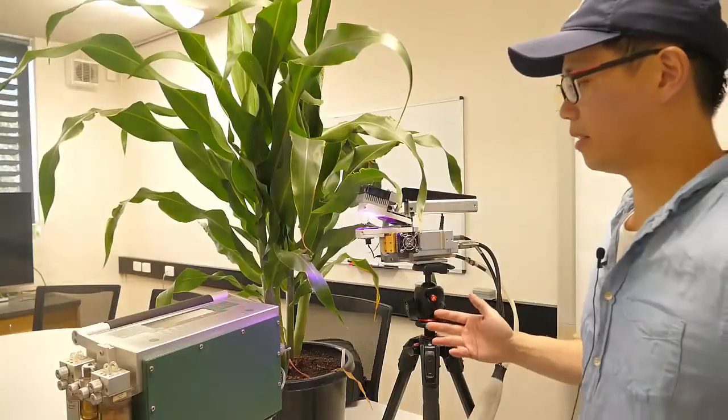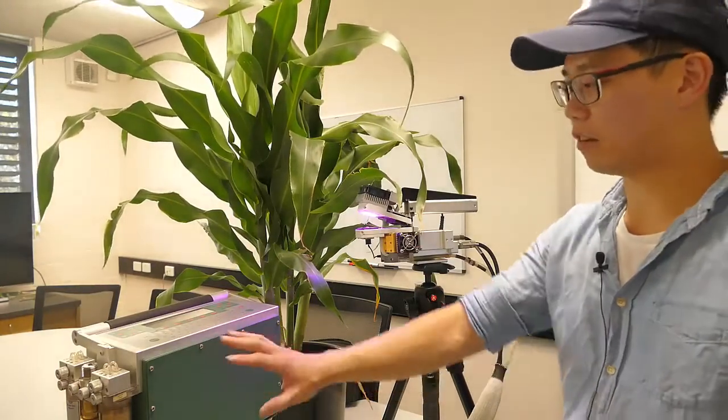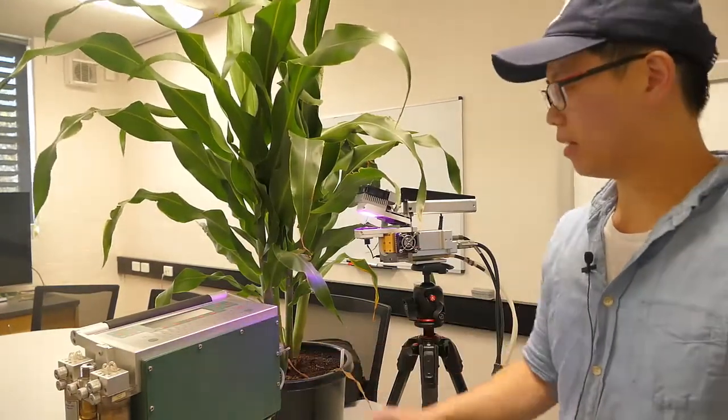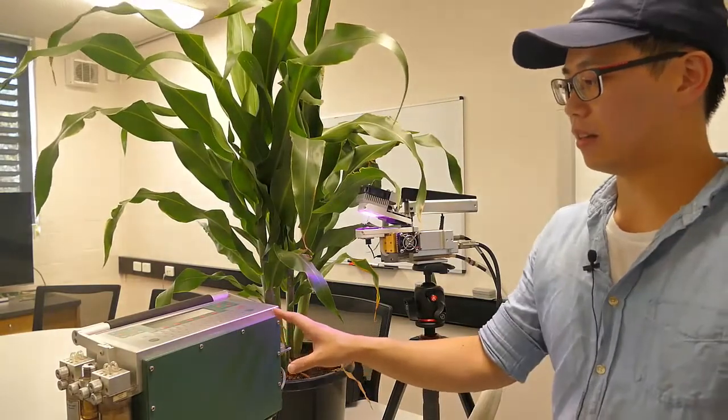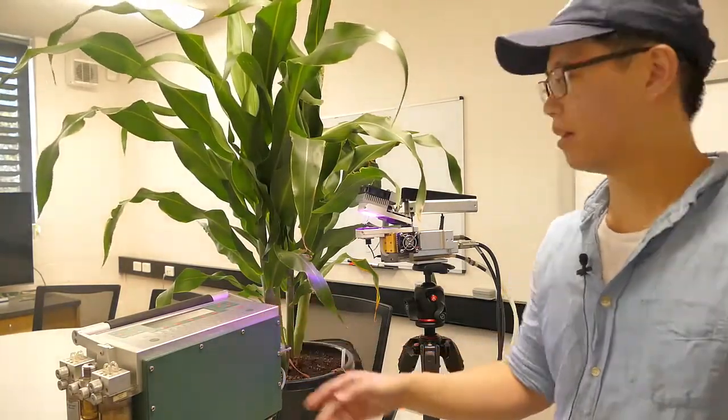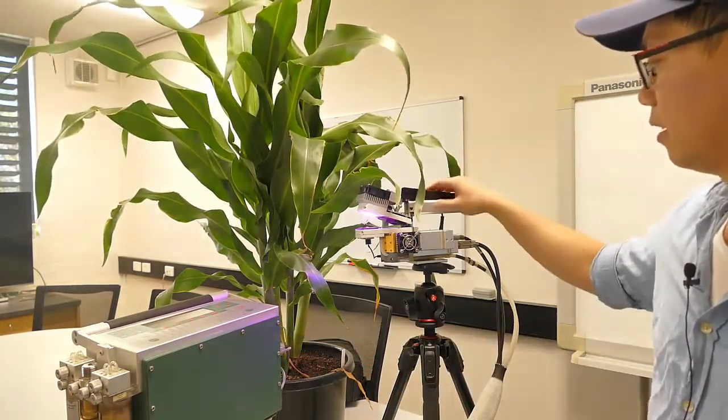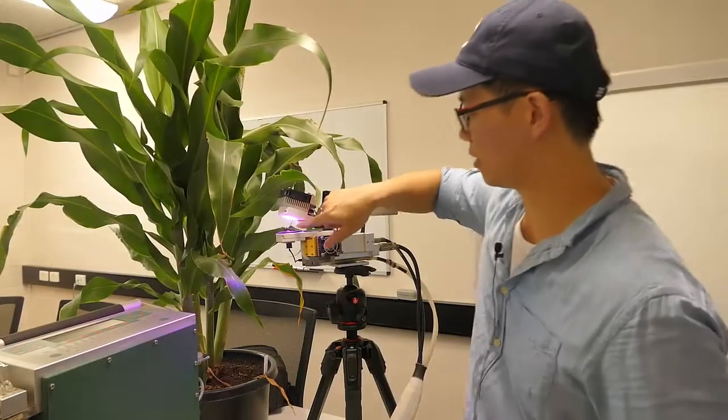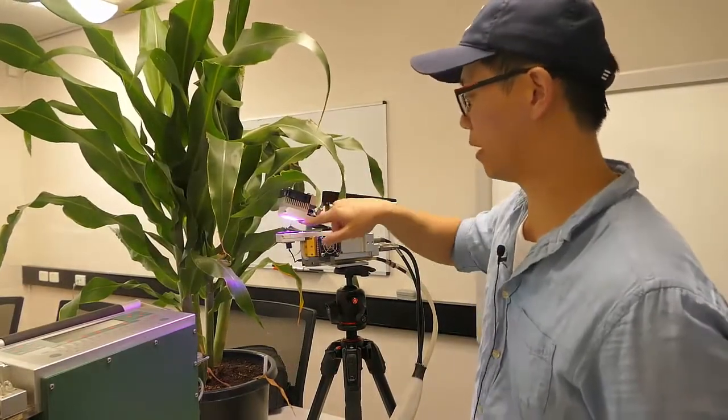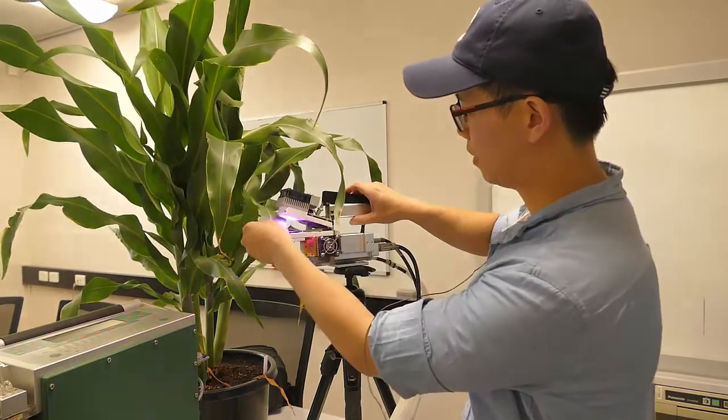So the way this machine works is you have the main console here. It has all the electronics in the box. It measures the change in CO2 and water vapor. If you come over here, there's the Licor head, and you can see there's a chamber. What you do is you clip your leaf inside this chamber.